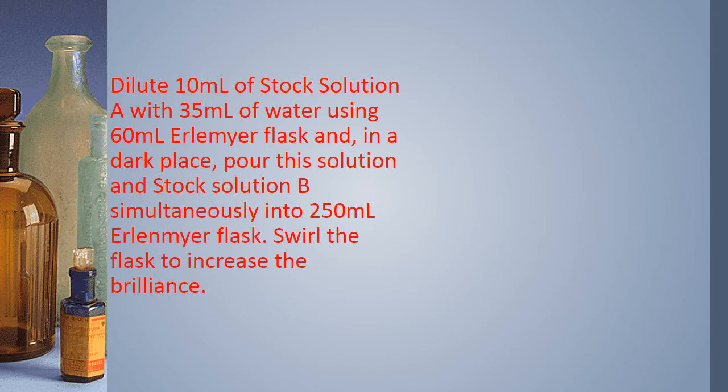We dilute 10 milliliters of stock solution A with 35 milliliters of water using a 60 milliliter Erlenmeyer flask. And in a dark place, pour this solution and stock solution B simultaneously into a 250 milliliter Erlenmeyer flask. We may swirl the flask to increase the brilliance.